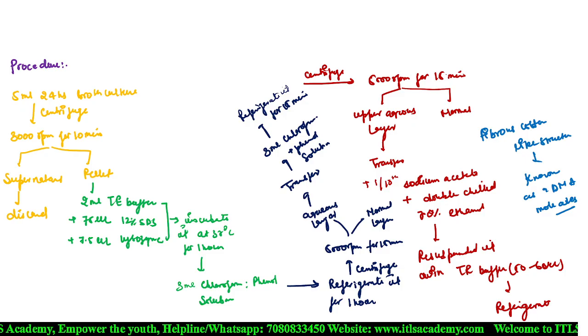Now, isolation of the DNA from human hair will also be explained, and after that, I will show you the video.